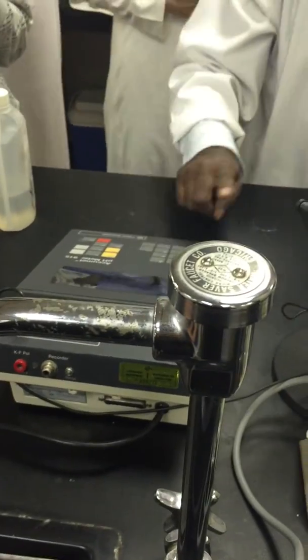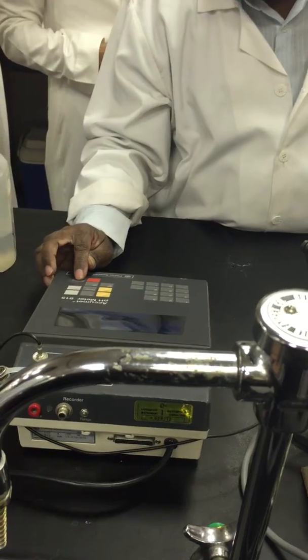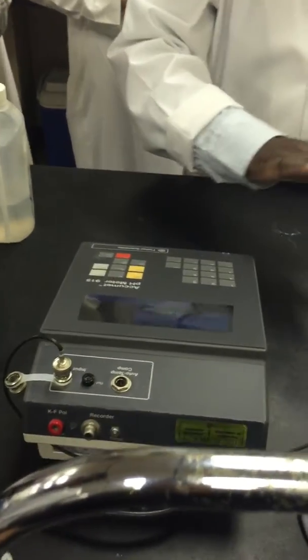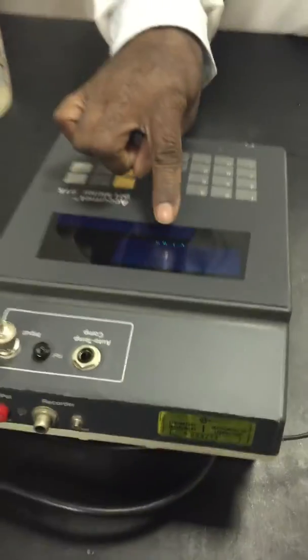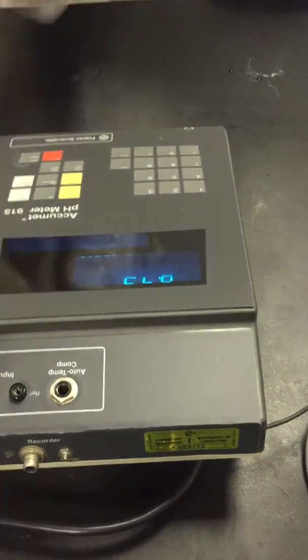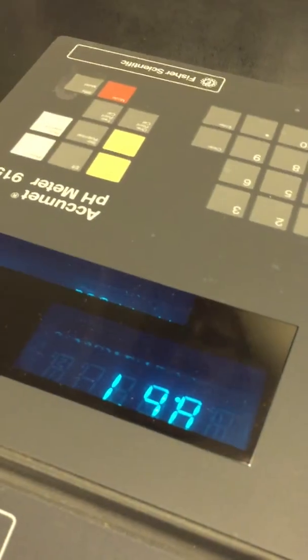Let it mix half a minute, 1 minute, then start. Why? If you start immediately, the reading will keep changing and you will be more confused about when to stop. So let it mix for half a minute, 1 minute, then you will use only this button, standby and measurement. Now it is standby, measurement, that's all. Then see the pH, how much? 8.67, right? Okay, can you see this is the pH?